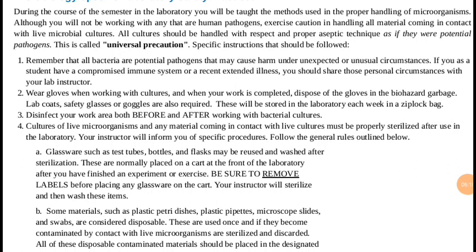You should also know how to wear and how to remove these gloves before and after use. It is usually advisable to also have lab coats. Safety glasses or goggles are also required. Now these will prevent you from being exposed to spills or to the bacteria.